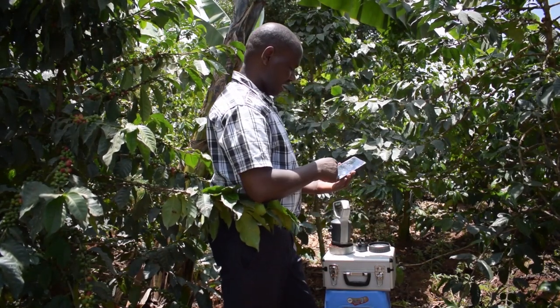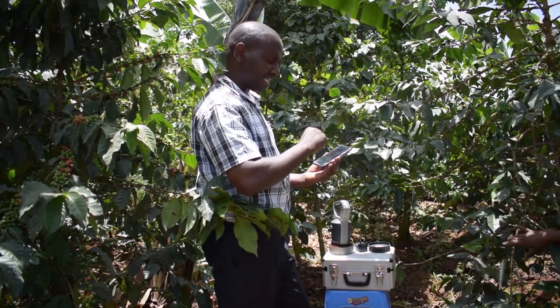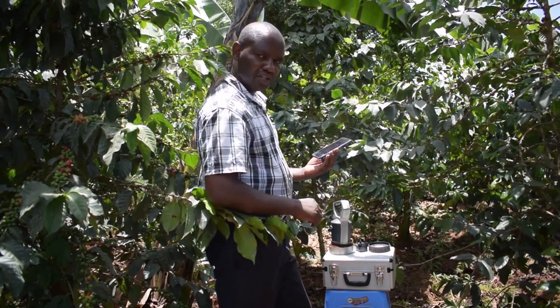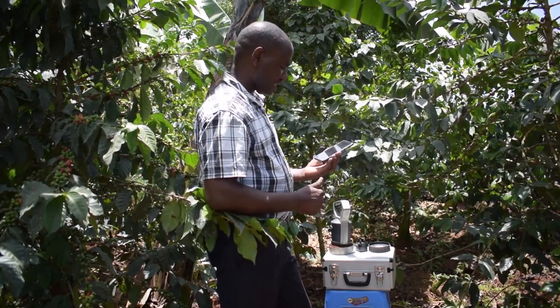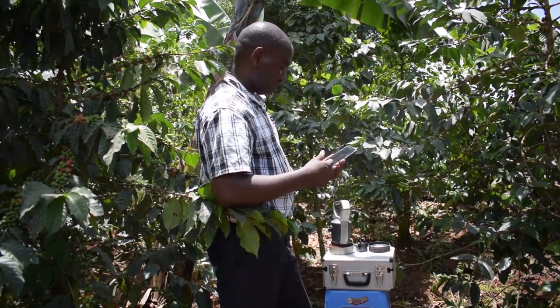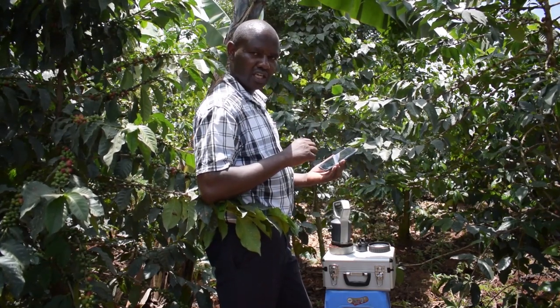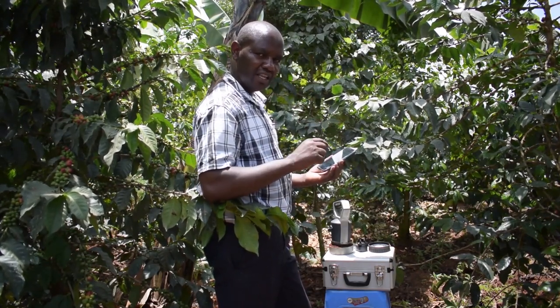As you can see, we are already in stage one. Once it is through with stage one it will show a tick, the scan button will stop, and we will see a green color. We wait for the machine to pick up what is in the soil. It uses near-infrared light.